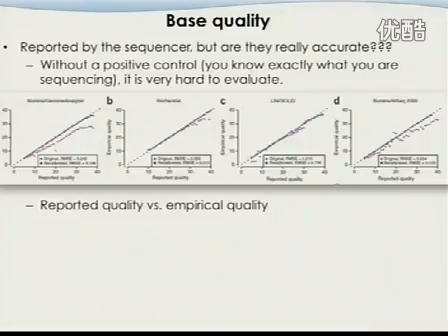And this is a paper published in Nature Genetics a couple of months ago. I'm sorry, this is a little small. This is 4 different platforms. This is the Illumina GA2, which is an earlier Illumina platform. This is 454. This is SOLiD, and Illumina HiSeq 2000.